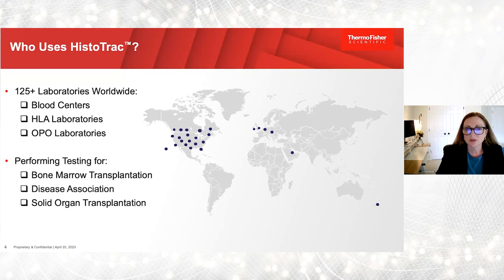So who is using HistoTrac? Jim mentioned we are installed in about 125 laboratories throughout the world. So those are blood centers, HLA labs, OPO labs. They're doing testing for bone marrow, disease associations, solid organ.